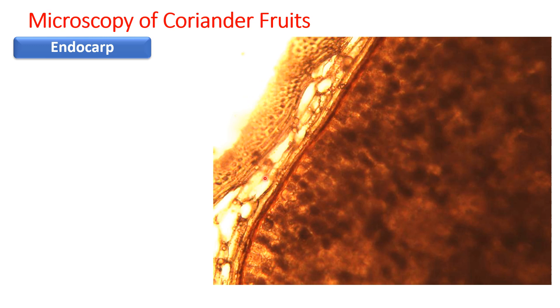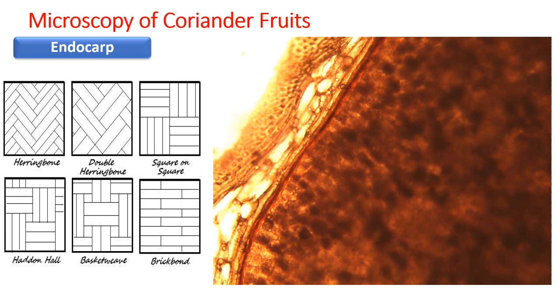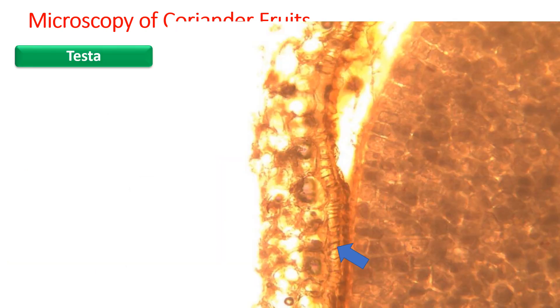The endocarp of this fruit is quite similar to that of fennel. You can see the cells running parallel with each other — this parallel appearance is termed the parquetry arrangement. A set of cells is parallel to each other within a group, but they are not necessarily parallel to another group of cells. This is characteristic of umbelliferous or Apiaceae fruits, usually seen in maple floor designs or tiled floors.